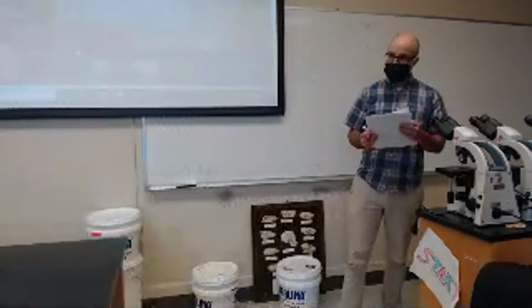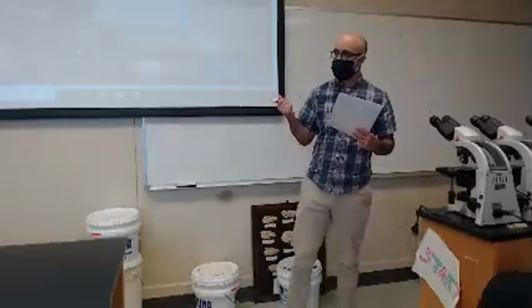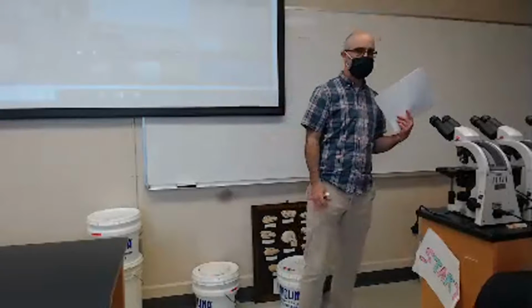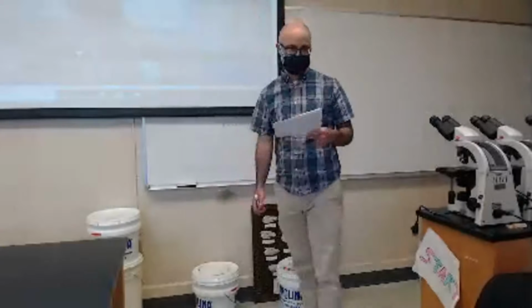My goal for today's lab is twofold. One, I just want to give you an overall picture of this second lab exam. And two, we're going to look at a few fish dissections. That includes a dogfish shark and a freshwater drum. And we have the animals for you to dissect if you want, or I can do a demo.